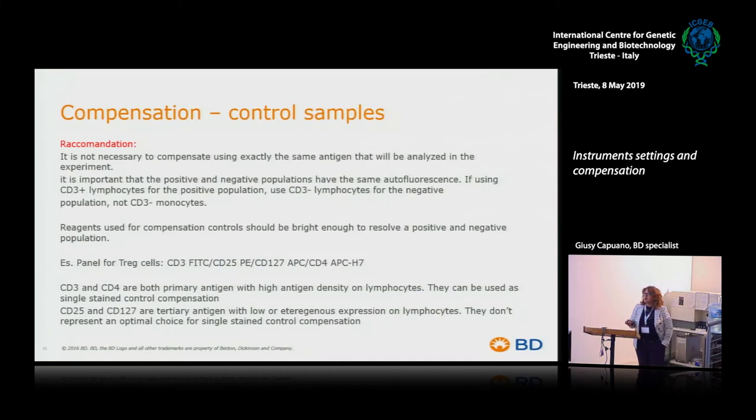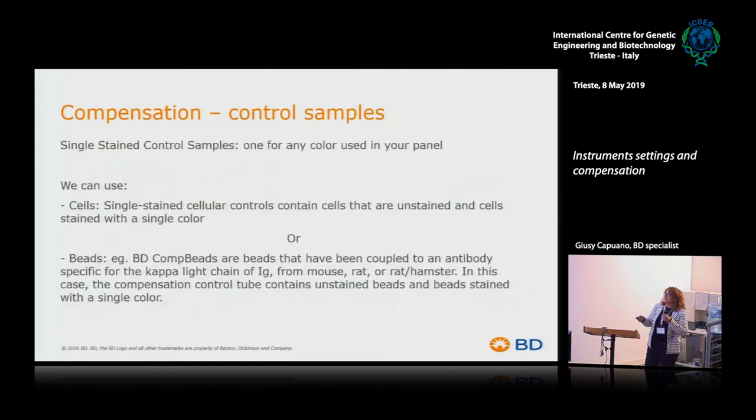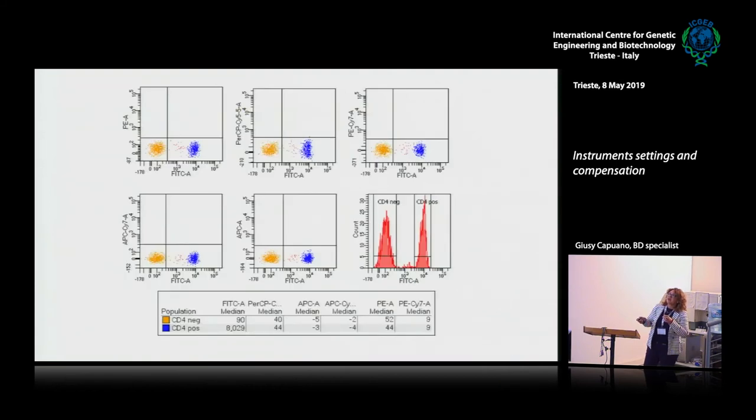And this marker is a so-called tertiary antigen. What I mean? It has a heterogeneous expression and a low expression in some types of cells. So using this, I can see this situation: I can see very, very few dots in this area, and I can't visualize the correct distribution of my population.